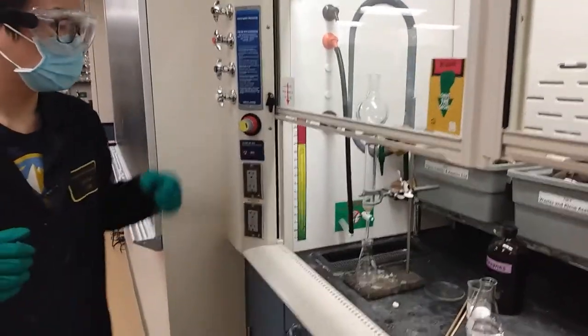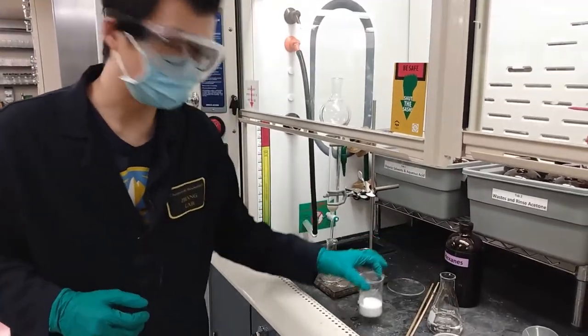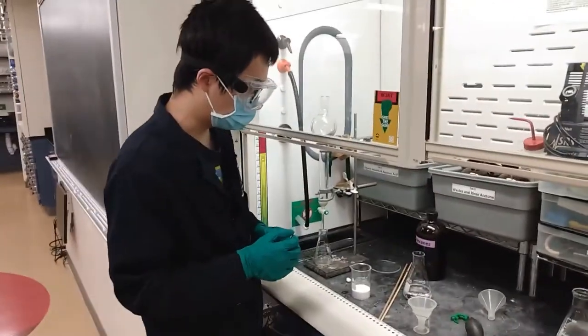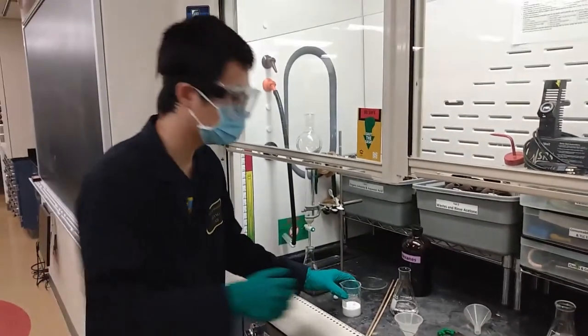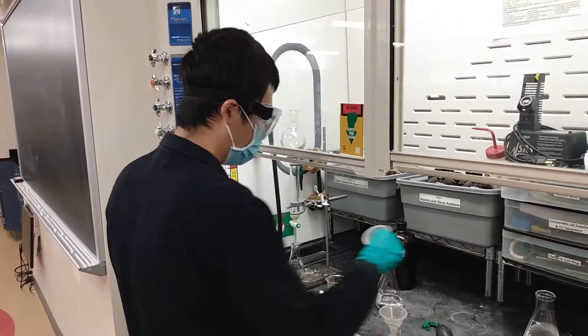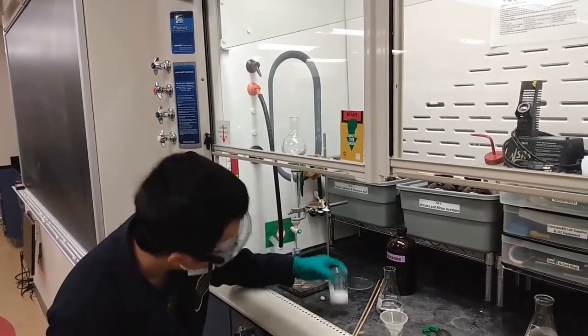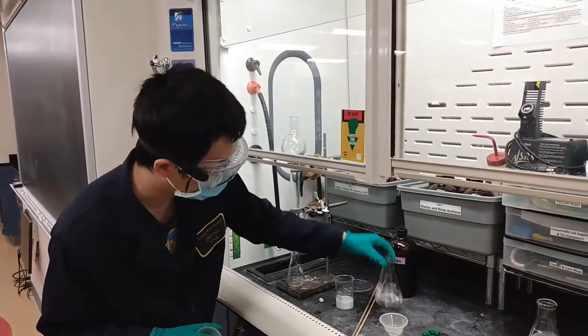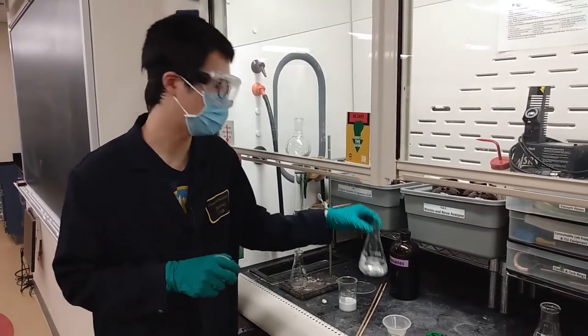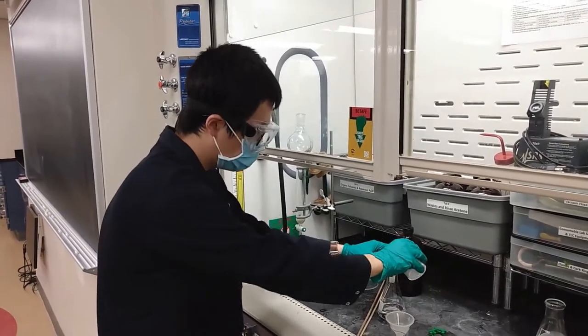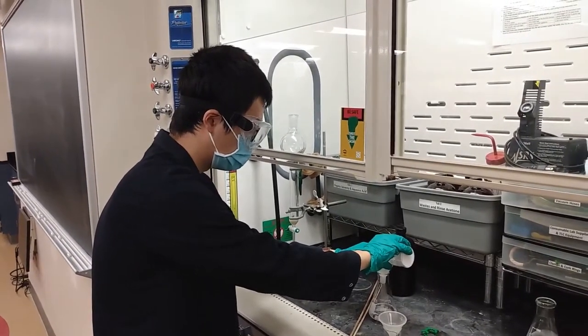The next step is to load the silica gel into the column. This is wet loading. We have around 50 ml of silica gel in this beaker and around 100 ml of hexane, so we add the silica gel to the hexane.